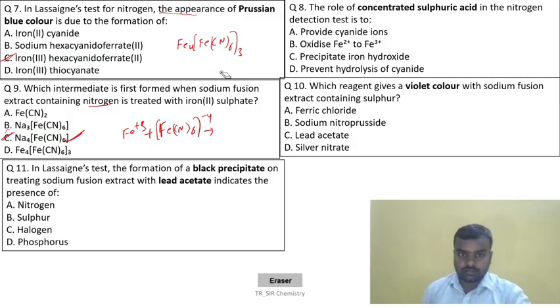Sorry, what will form here? Yeah, Prussian blue will form, right? This will form this complex.